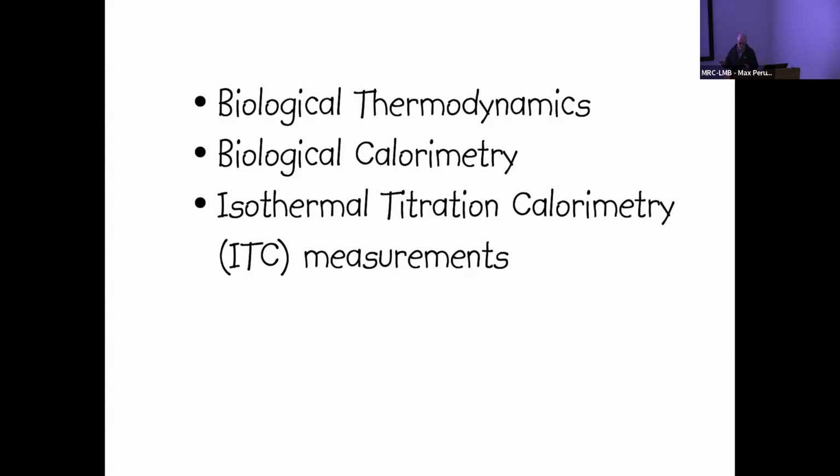There are a number of interesting aspects of thermodynamics that can influence either the methodology we might want to use or the behavior of our systems. I'm then going to talk about biological calorimetry, which is what we're here to understand, but in a more general context about why we would want to do it and how we might think about doing it. And then finally, talk about one of the most popular forms of calorimetry for biological applications, ITC, isothermal titration calorimetry. If I go over the time, I apologize, but I will try and keep it under an hour.